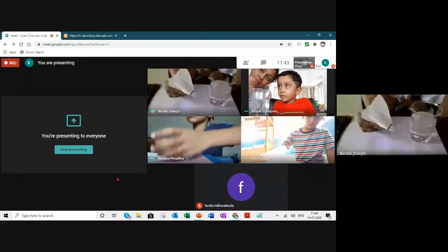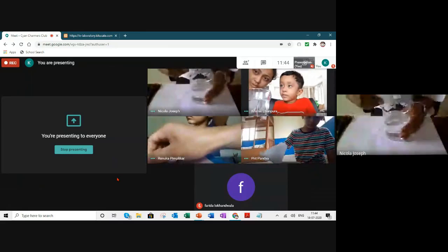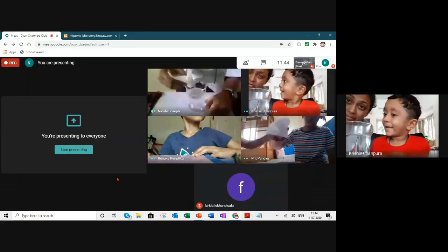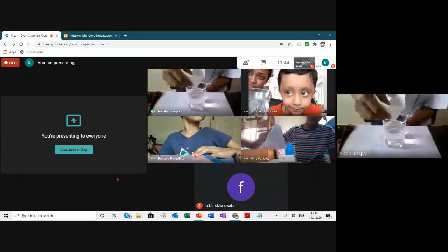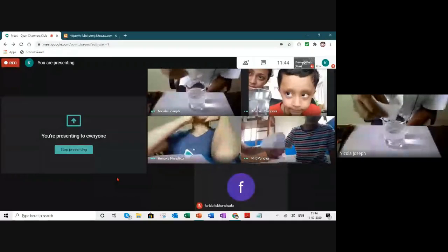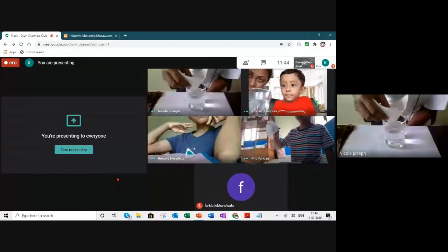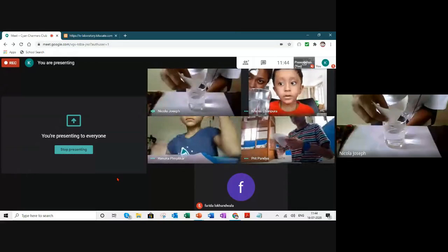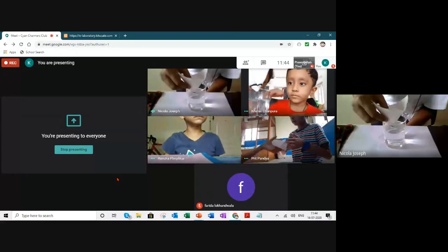See, I am doing it. Is it visible to everyone? All of you do it. Don't let the black line touch the water. Dip it a little, and after some time, you all will see something. You all will tell me what you have seen.